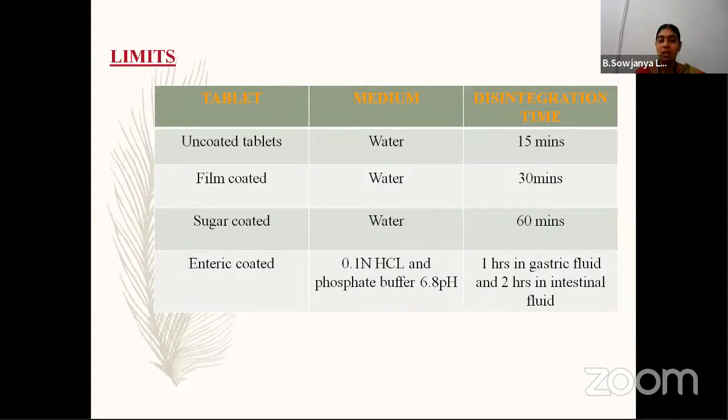So these are the limits and the medium for different types of tablets, with the disintegration medium along with the time. For uncoated tablets, we take water as the medium, and the tablets break down into granules within 15 minutes. Film coated tablets disintegrate within 30 minutes.